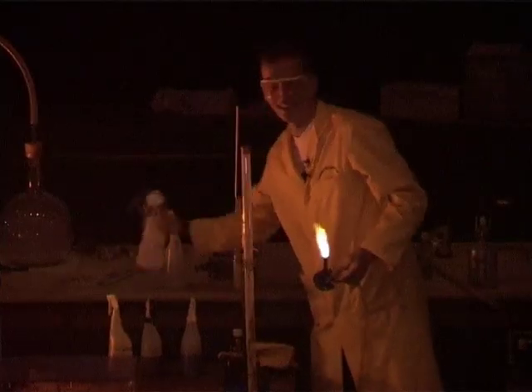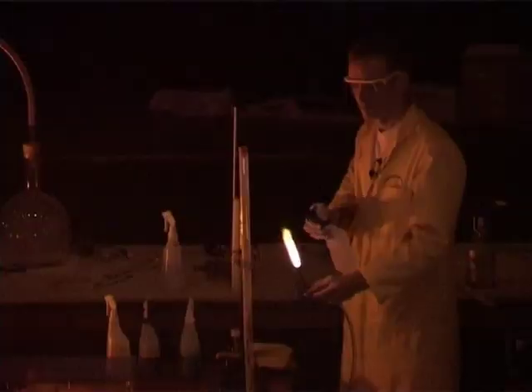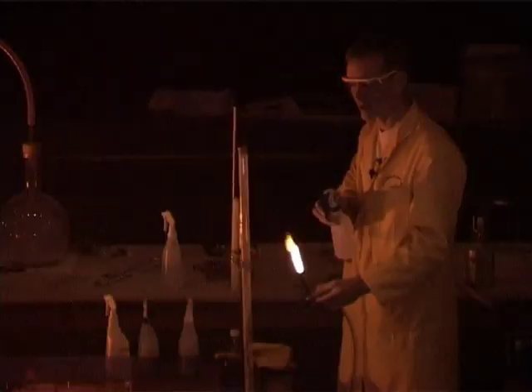Well, different elements give slightly different colours. In fact, we could even identify which element we're looking at just by the colours that are given out if we analyse the flame very carefully. For instance, potassium chloride gives a very different colour. Nice lilac colour.